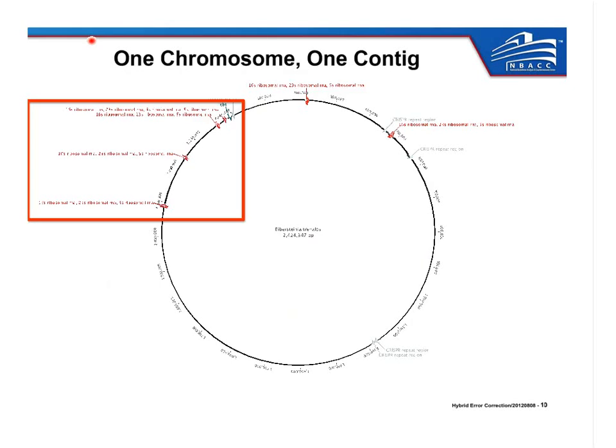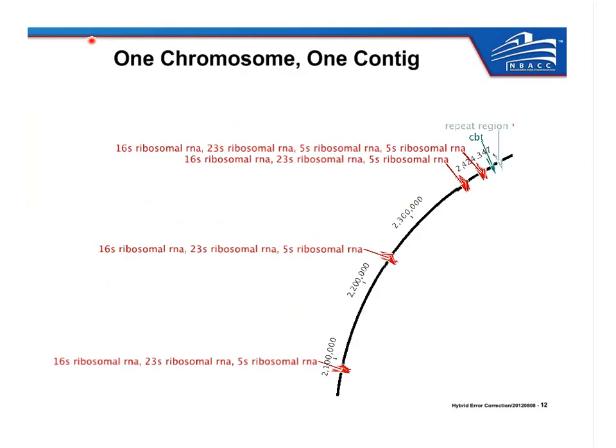And what I wanted to focus on is some of these larger repeat structures. So you can see that we're able to correctly reconstruct these repeats that are typically very difficult for assemblers to reconstruct because they're 5,500 bases. So there's a lot of ambiguity, and there's a lot of places in the genome they can go. You can see that the RNA operon, even in the small chunk of the genome, has 4 different copies. And typically, you wouldn't know which copy goes where in the genome if you have short read data. And in our case, since we have the 6 KB reads, we can unambiguously place them and reconstruct it and accurately get all the RNA operons placed along the genome.